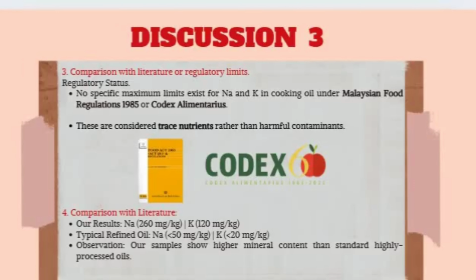Assalamualaikum warahmatullahi wabarakatuh. Today I will discuss discussion 3 of question 3, the comparison with literature on this experiment, or the regulatory limits or the act. In this case, we use Na, which is sodium, and K for potassium in cooking oil, so there are no maximum limits that exist either in Malaysian Food Regulation 1985 or Codex Alimentarius. So we use Codex Alimentarius and Malaysian Food Regulation 1985 as a comparison.